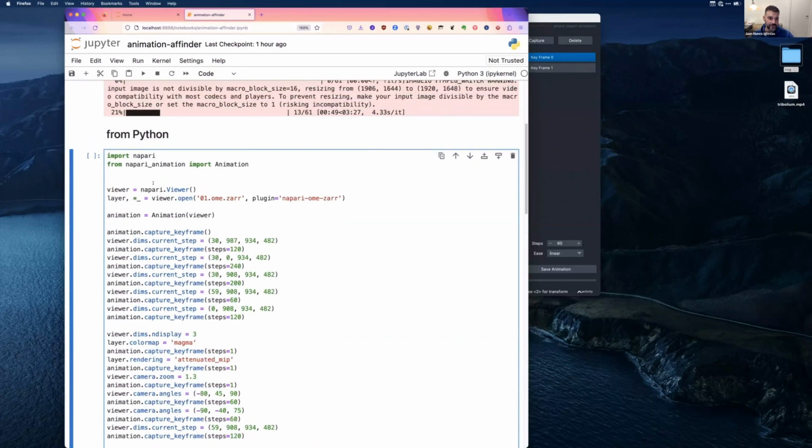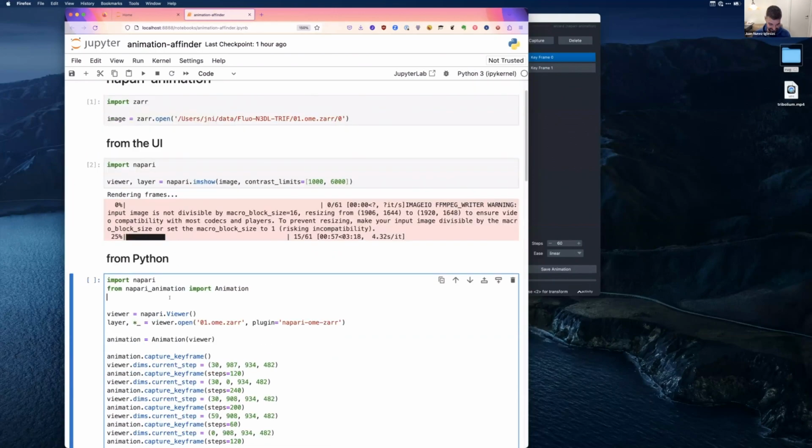So here I'm doing something similar. Again, I can't run it while my kernel's going. Oh, maybe I can. Maybe it's doing it in a new thread, which is kind of cool. I didn't know this. Hang on, let me try something.